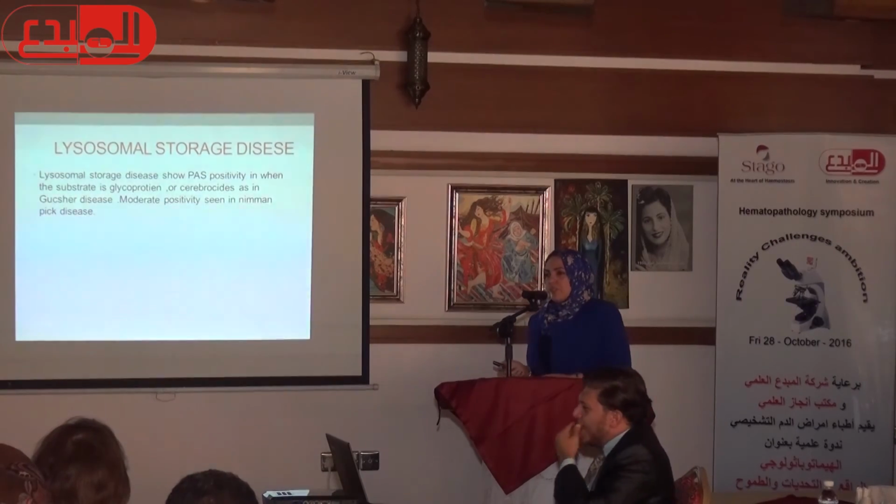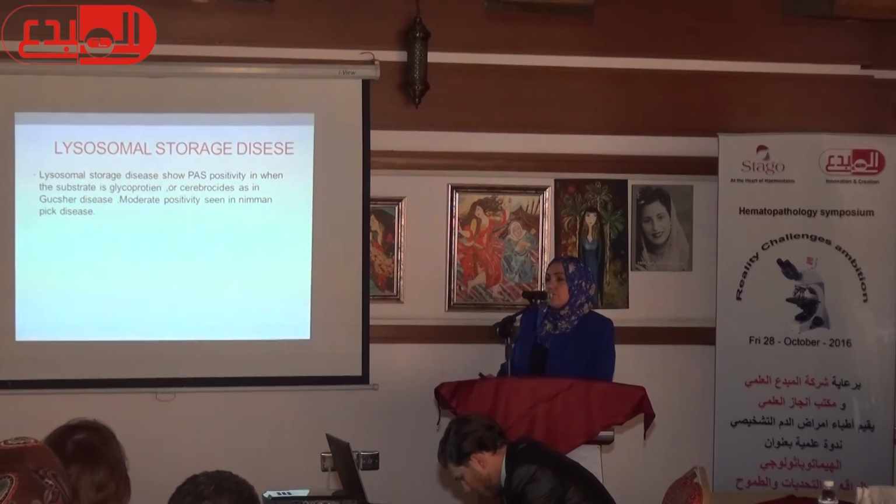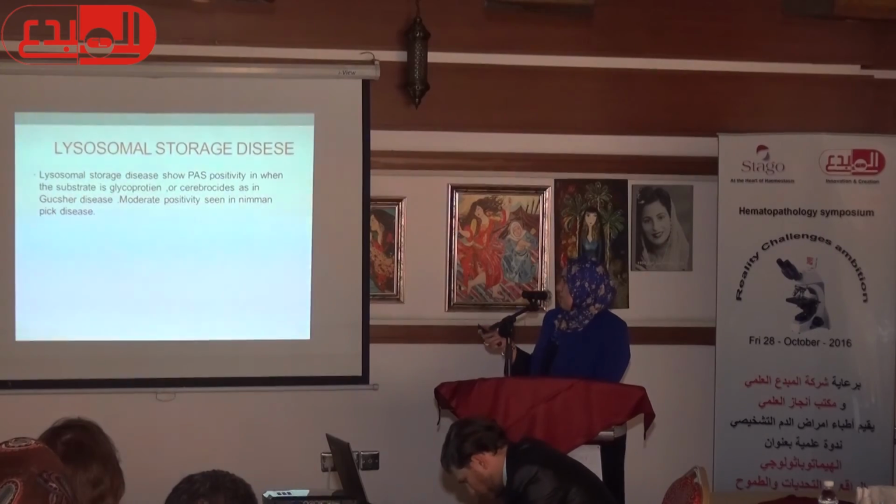In lysosomal storage disease, actually we take different stains for lysosomal storage disease. All the available stains we have, we stain them for lysosomal storage because of the different substrates that could be found in lysosomal storage disease. Lysosomal storage diseases show PAS positivity when their substrate is a glycoprotein or cerebroside, as in Gaucher disease. Moderate positivity is seen in Niemann-Pick disease.